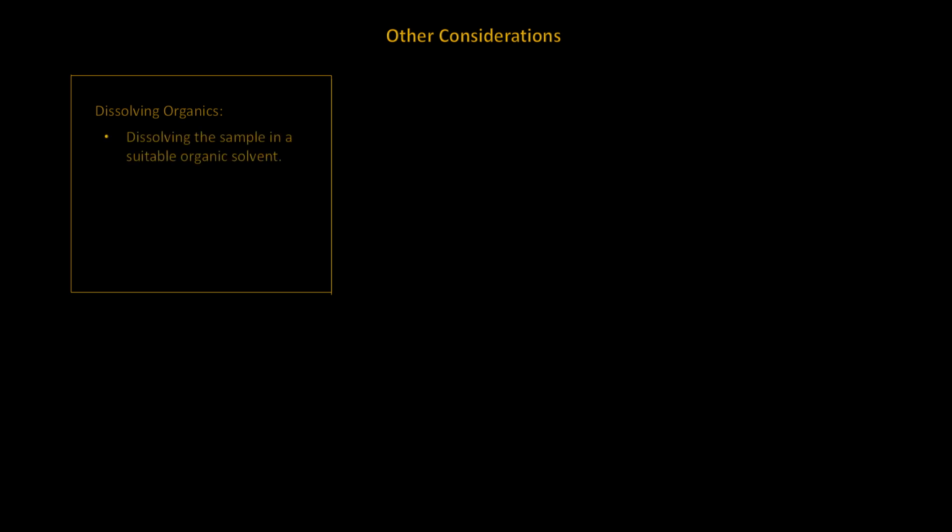Some of your samples will contain organic substances, especially in soil samples. Organics can be dissolved using an organic solvent, such as acetone, ethanol, ethyl acetate, diethyl ether, and others like toluene or benzene. Now, dry oxidation is normally referred to as ignition for the removal of organic material. This is when the material is burned to an ash, then dissolved using a suitable acid. Dissolving a sample with an oxidizing acid such as sulfuric acid or nitric acid and adding a catalyst like copper or selenium is called wet oxidation.